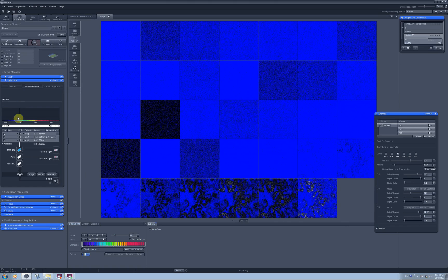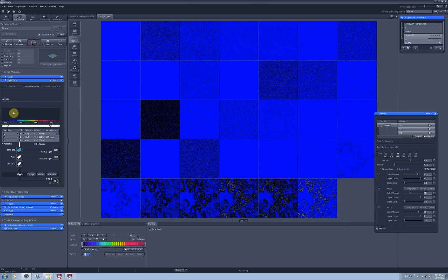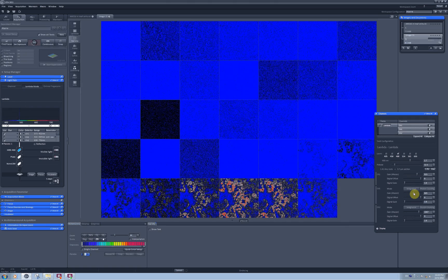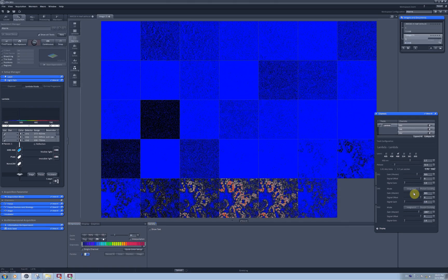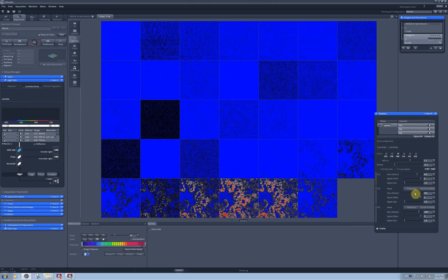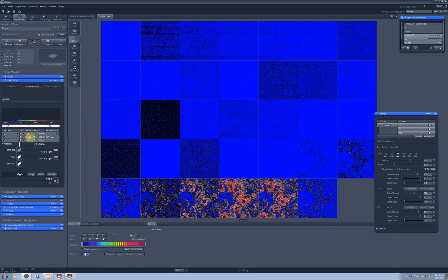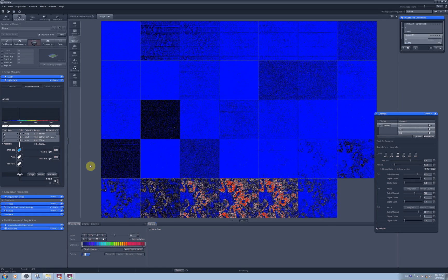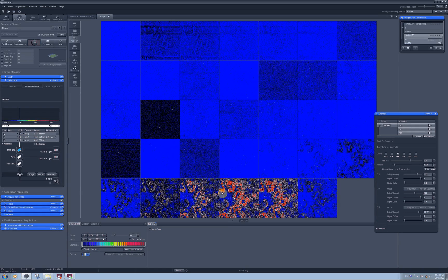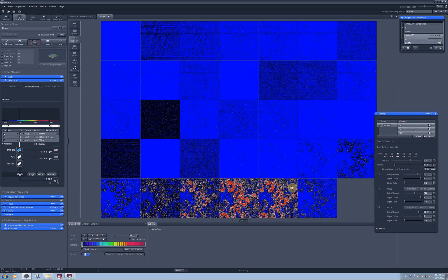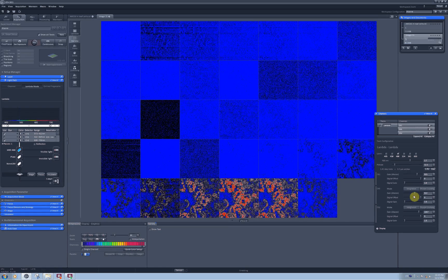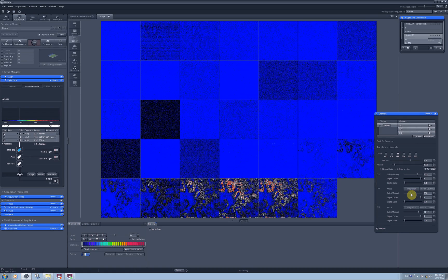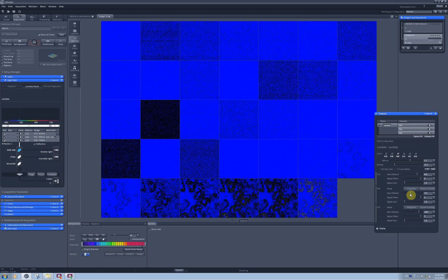It's basically looking for a fluorophore with an anti-Stokes shift. And then on the quasar detector, this one, I can easily see that chloroplasts are showing up and I don't want them to be oversaturated.